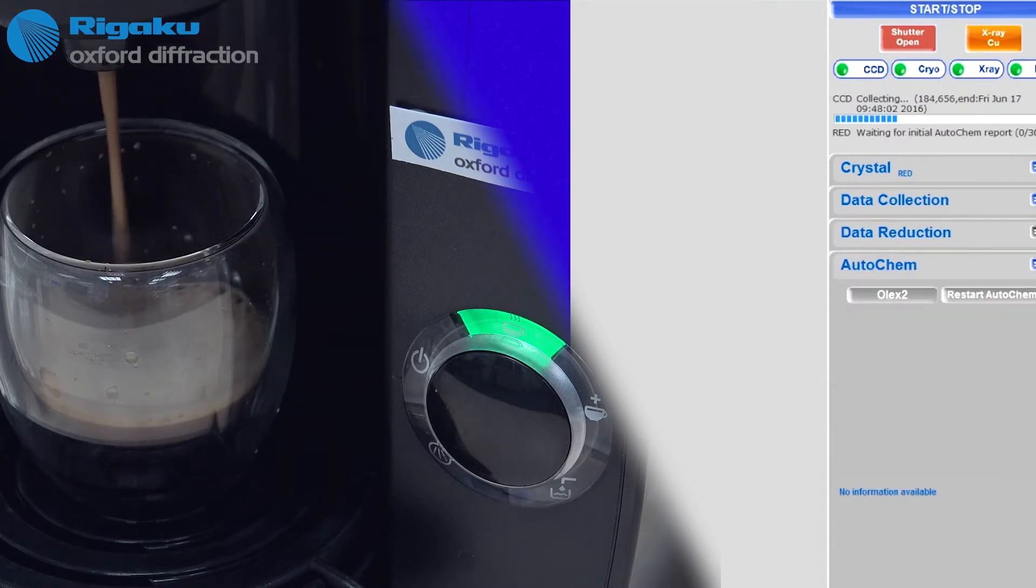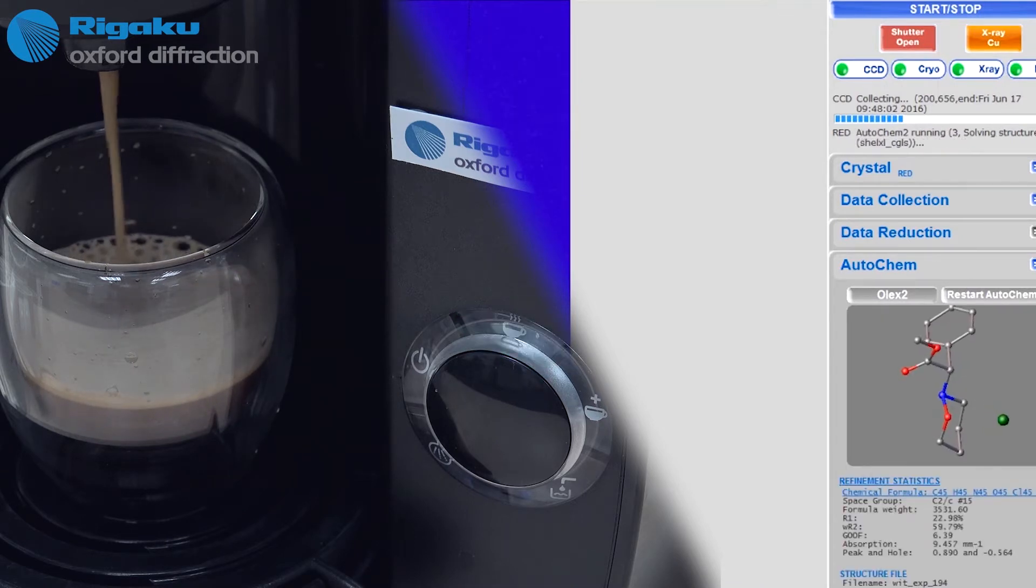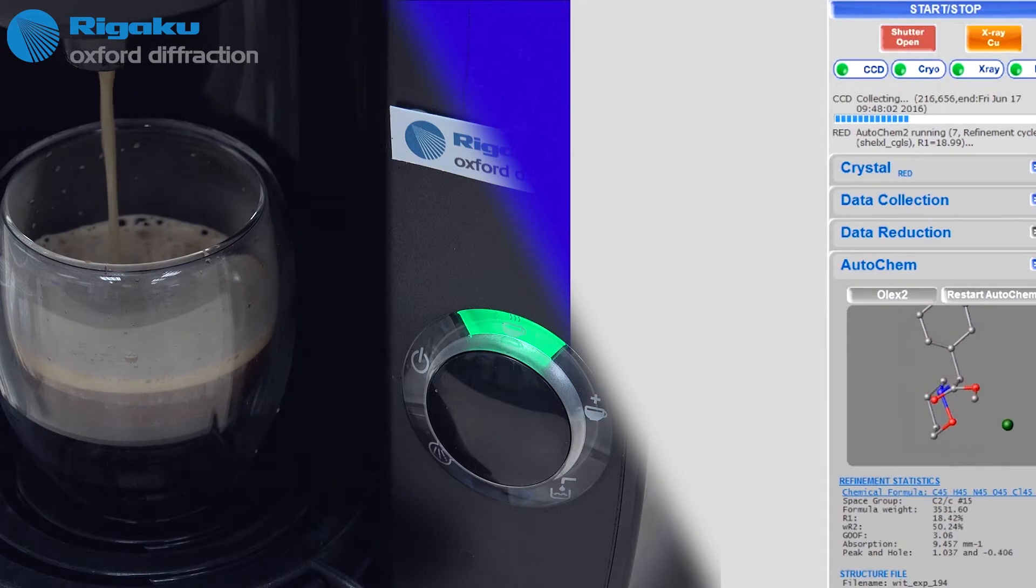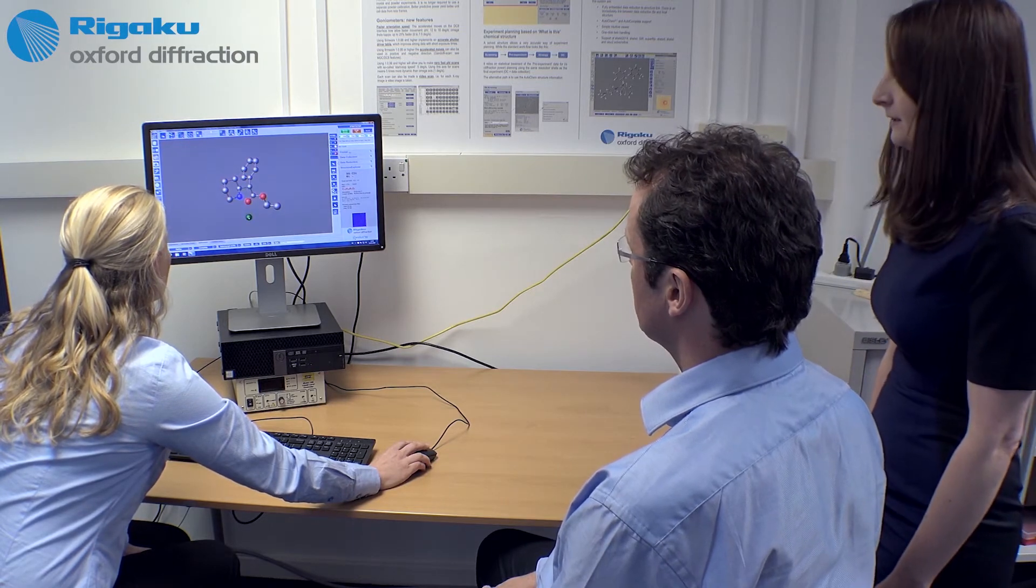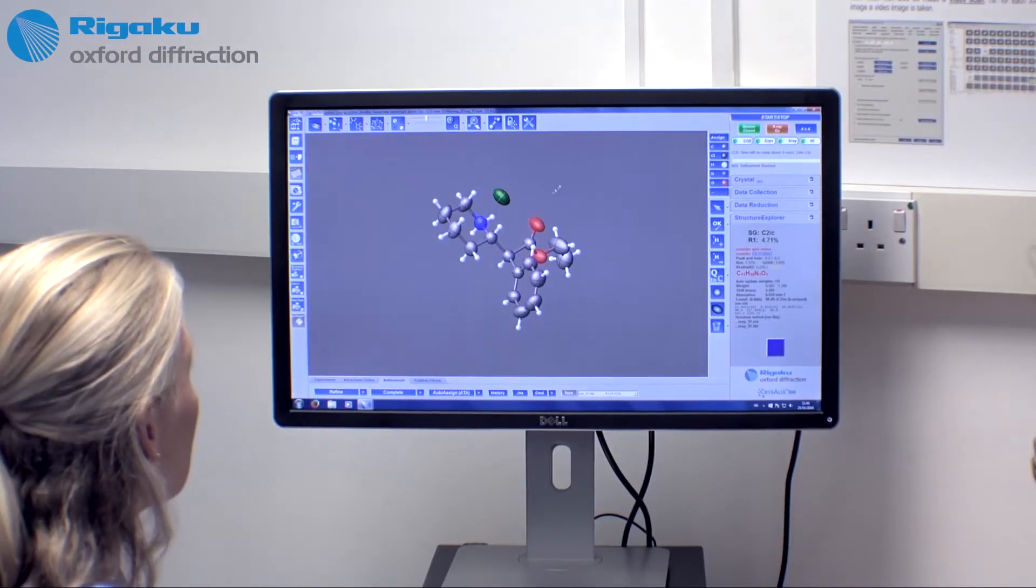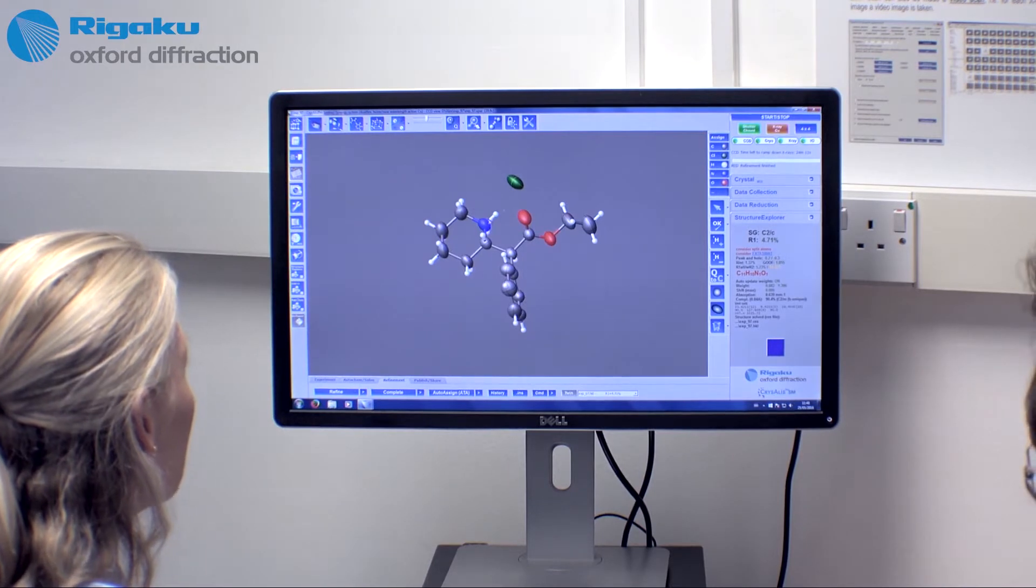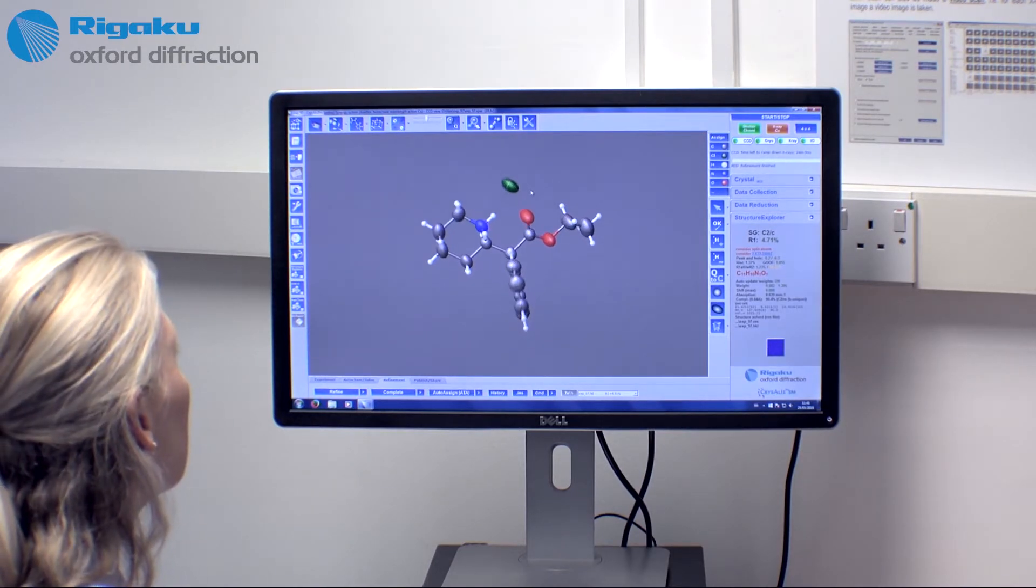Once you own a Crystal Lab Synergy diffractometer, you will now have to drink your coffee to celebrate your new structure rather than waiting to see if the quality is sufficient. The What Is This experiment collects just enough data to show the atomic connectivity and works in partnership with AutoChem to solve and refine the structure automatically.